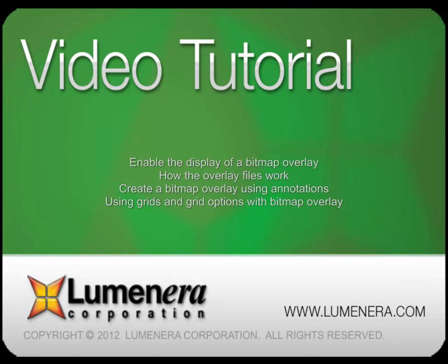In this session the following topics are reviewed: enable the display of a bitmap overlay, how the overlay files work, create a bitmap overlay using annotations, and using grids and the grid options.